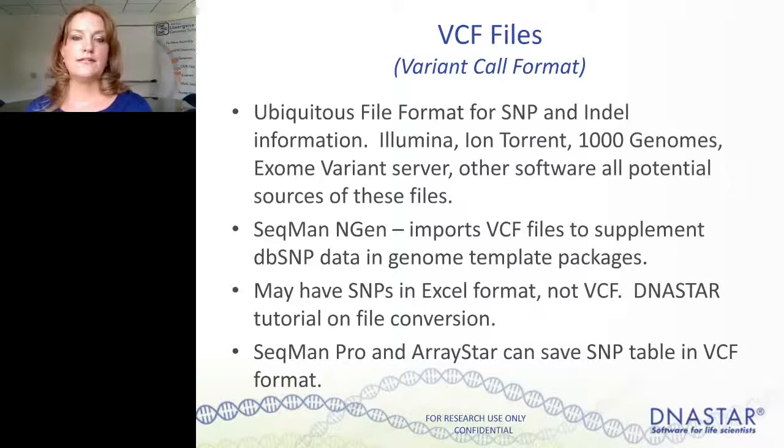So what are VCF files? Well, VCF stands for Variant Call Format. And these you can get from a variety of sources. Like I mentioned, they might come with your gene panel. You might also find them in 1000 Genomes, Exome Variant Server, or other software.